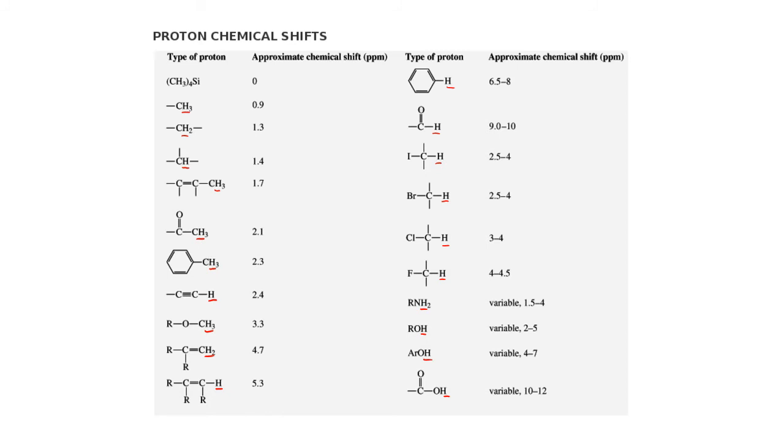Now, I just spoke about alkanes having chemical shifts in that 0.7 to 1.5 range. So these three, the CH3s, CH2s, and CHs, represent the hydrogens found on carbons in alkanes. Anytime you have just a regular CH3, it comes out around 0.9, CH2 is around 1.3, and CH is around 1.4. And again, these are approximate chemical shifts.